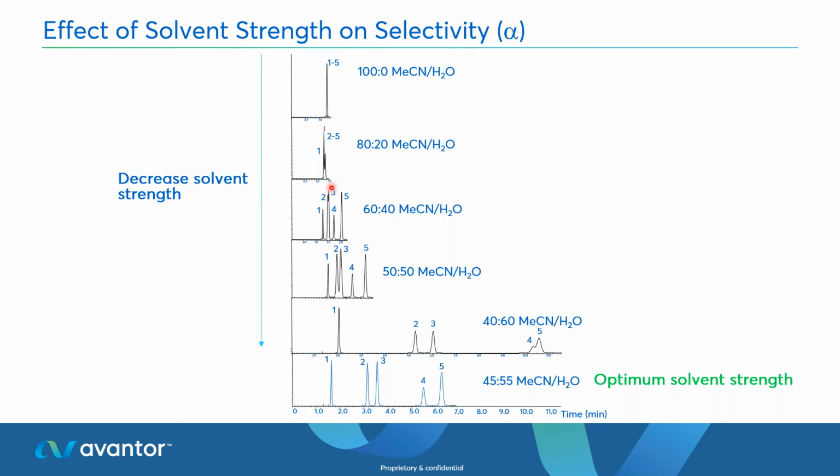And you've seen from those early graphs that actually you only need to look at 2 different percentages, a high one and a low one, to draw your straight lines for each peak, and then you can pretty much pick the right percentage organic to work out the best separation. So because they're linear, you can pick 2 points quite wide apart. Your third point would be the one to prove that that's the correct percentage organic to work at.